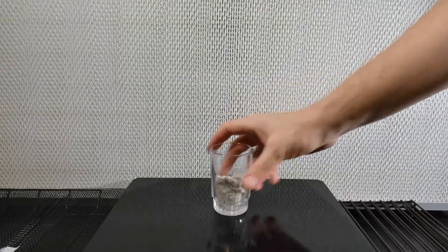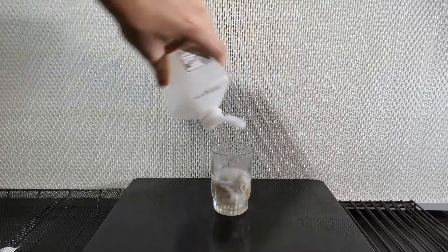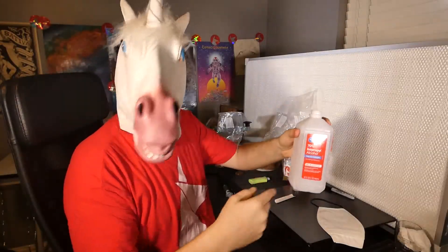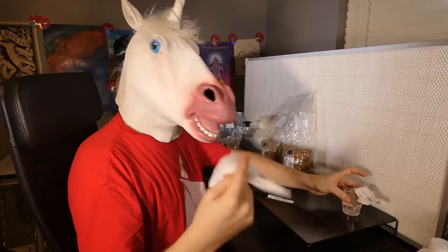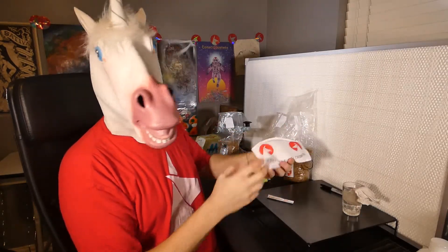To begin, get a small cup of isopropyl alcohol. Anything between 60 and 90% will work. Any lower and it's too diluted, but any higher and it will actually cauterize the cells rather than dissolve them. Another important thing is proper lab attire.